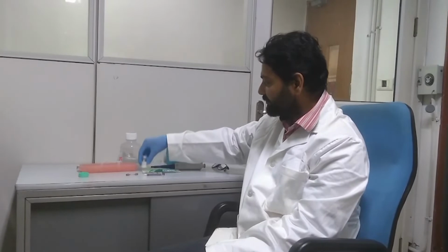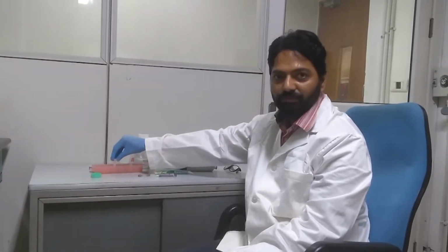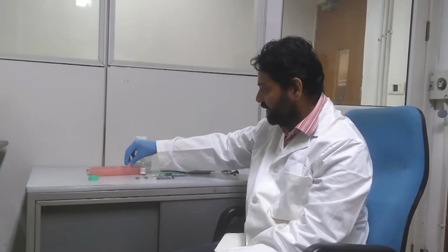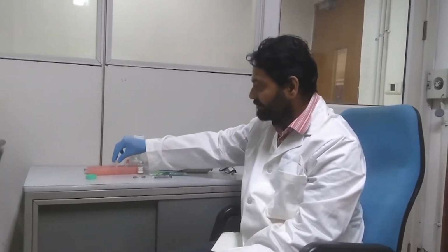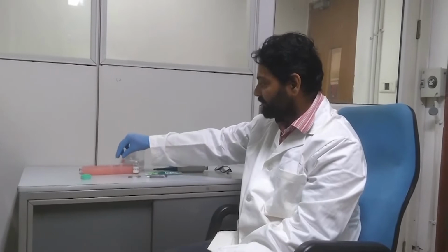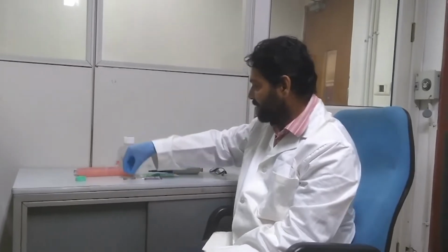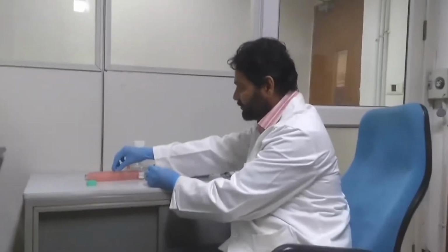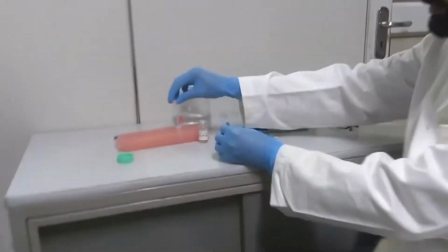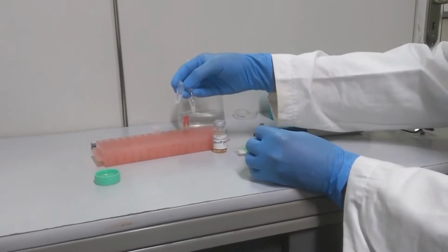Then we take out some of the Freund's complete adjuvant in an Eppendorf tube and mix them together. Since this adjuvant is oil based, it doesn't mix easily with a watery system like the antigen in PBS. Therefore, we mix them rigorously and forcefully. For that purpose, we take these two, we mix this emulsion, PBS containing antigen and the oil-based adjuvant.